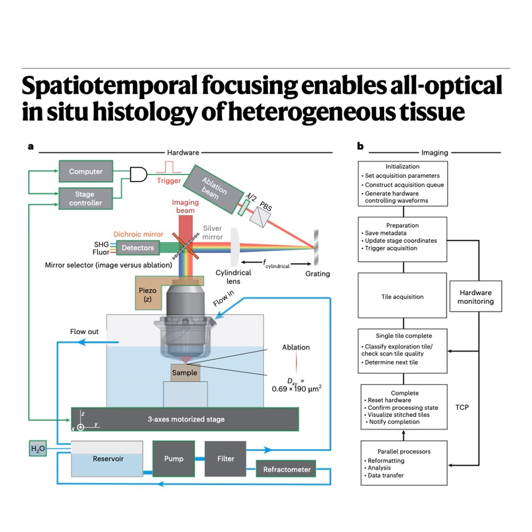Why is it so critical? Because the refractive index, or RI, of the immersion medium directly affects the focal length of the objective lens. If the RI changes, the laser focus shifts up or down. And over days, especially with a flow system, the more volatile components, like water, are going to evaporate faster than others, right? So the RI will drift.